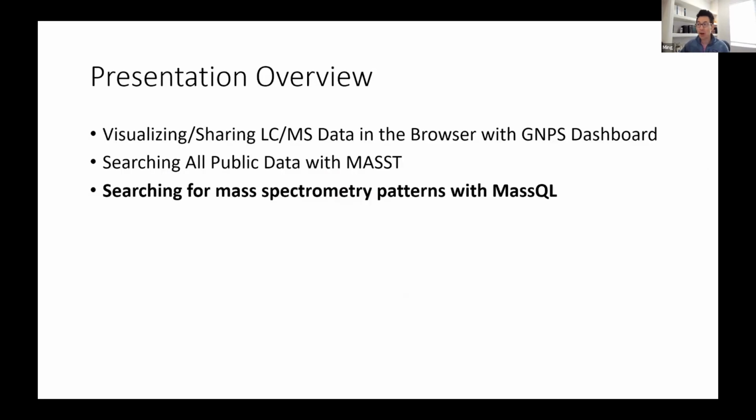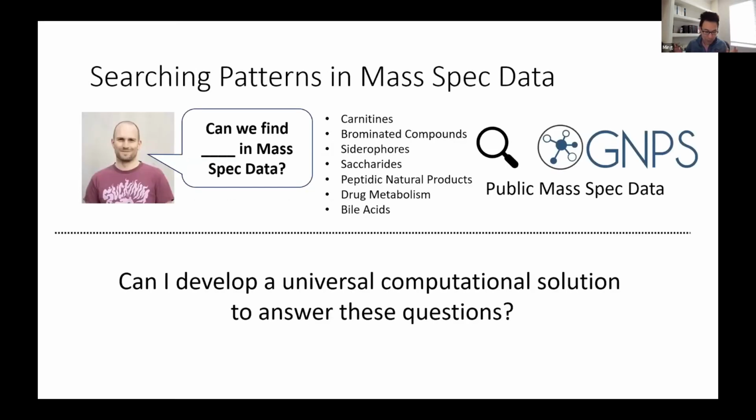Cool. So one of the other things I'll talk about at the very end is something I'm personally excited about. We're writing up the paper now, but this is something I created over the last year, again, out of sheer laziness. A lot of you are analytical chemists and mass spectrometrists. So let me take a step back: mass spectrometry is a tool that allows us to measure a lot of molecules, right?